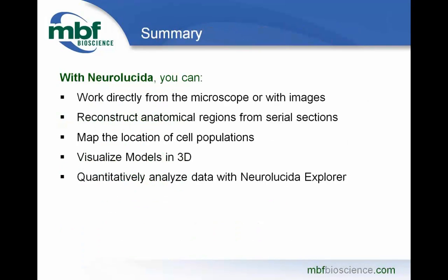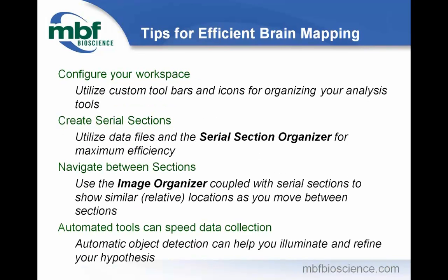But some tips that we have for efficient brain mapping include configuring your workspace. We showed you at the very beginning how to utilize custom toolbars and toolbar buttons in order to organize your analysis tools for the particular application that you're using. And I organized all of that by creating a profile specifically for brain mapping.